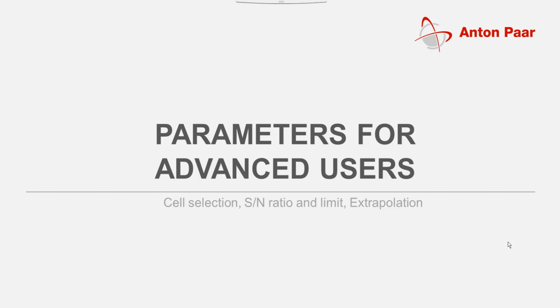The parameters I've listed so far are the first we consider anytime we have to use the advanced parameters. The ones I'm going to describe in the next slides can be used only in case the sample is well known. You know exactly what you are looking for, and you know the instruments you are working with. Among these parameters, you find the cell selection, the signal-to-noise ratio and limit, and the extrapolation functions.